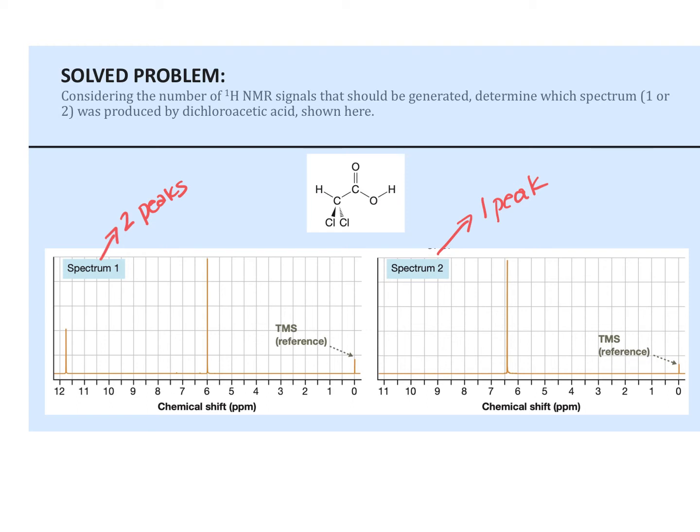Now, on the next slide, I have a table for you that gives you some questions to think about. One is, is there a unique point of reference in this molecule? And there are many unique points of reference. Another way to say that is there's no symmetry. And so we can use, for example, the oxygen right here. And it says, look, are the protons the same distance from that point of reference? Well, this hydrogen's much closer to the oxygen than this hydrogen is. So they are not the same distance, that means that these two are distinct.